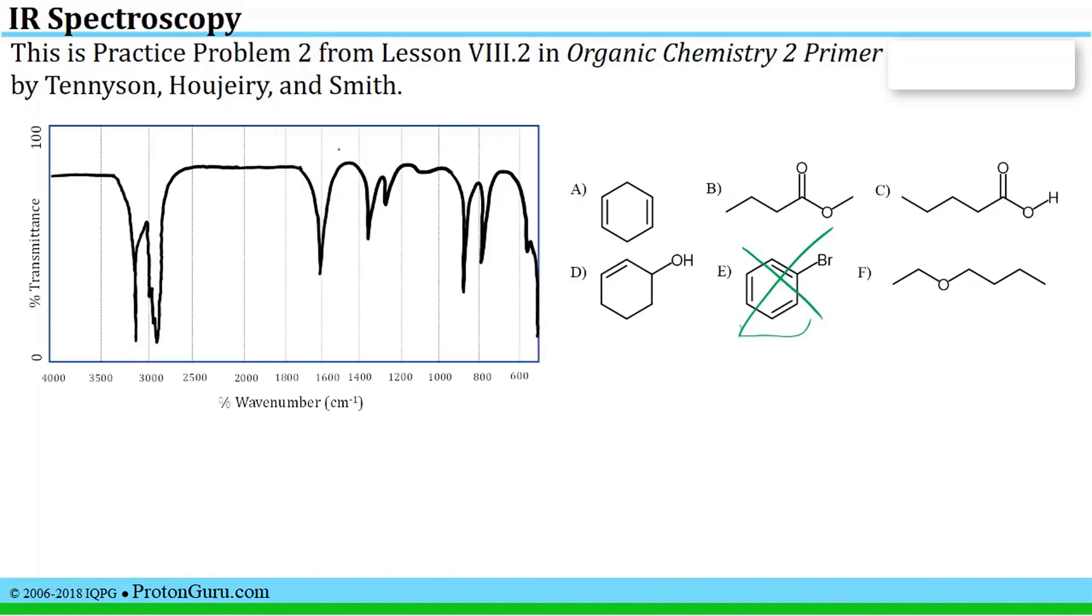We should also see a peak at around 1500 if we have an aromatic due to having the benzene ring, and we don't see that either. At that point, we can conclusively say there is not a benzene ring in the product. Now once we've ruled out the benzene ring, our decision tree suggests that the next thing we might look for is a C=O double bond. These are very easy to pick out in an infrared spectrum because they usually give you a really strong peak right around 1700. But we don't see anything like that in this spectrum either.